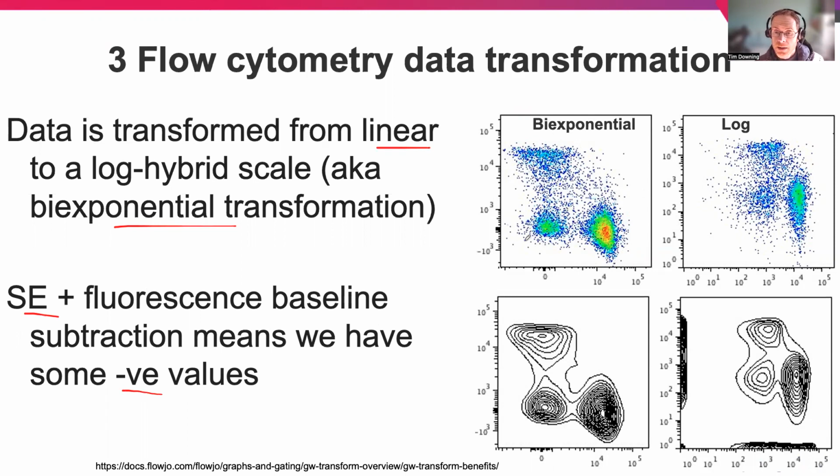What you note with these scales is that the 0 is along these two axes. And you can see that there are a substantial number of cell points on the negative scale, and that can be for both components here. Consequently, representing the true components of variation in our data is something that's of interest.